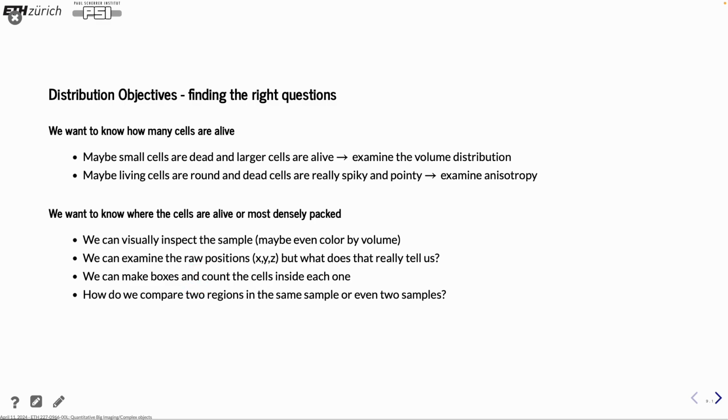And for the counting, we can also look at how different colonies are growing. So if you separate the image into different segments, you can count how many there are in each box, and then tell that these regions are probably better fed than other regions. And then we need some statistical methods to compare between these, but that is actually next week's lecture.